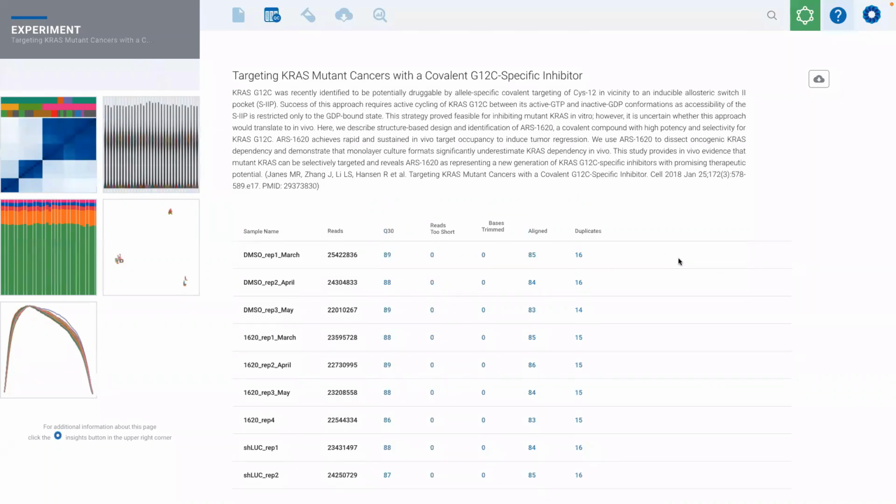If we find it, we will BLAST against all known species from NCBI to determine what is contaminating your samples and identify that, or maybe there's too much ribosomal RNA or whatever, we'll flag that for you based on what's there. So it's a great way to get confidence in the strength of our standardized RNA-Seq secondary analysis pipeline.